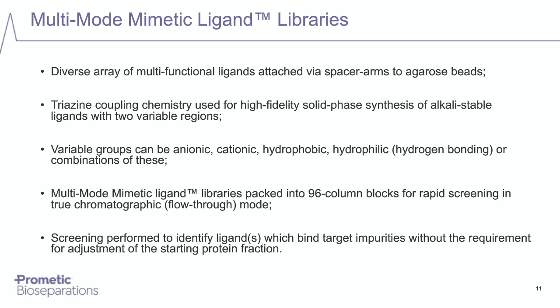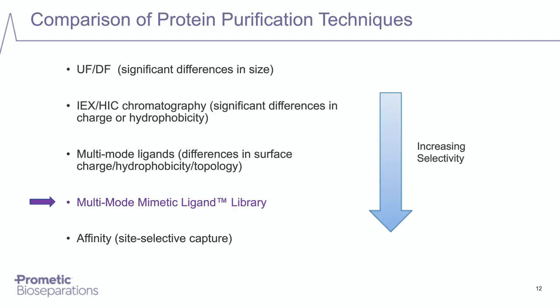So these multi-mode ligands now are a little more selective than the traditional multi-mode ligands, and they sit in this array of different purification techniques. They're not quite as selective as the affinity type ligands, but they're more selective than the traditional multi-mode ligands.